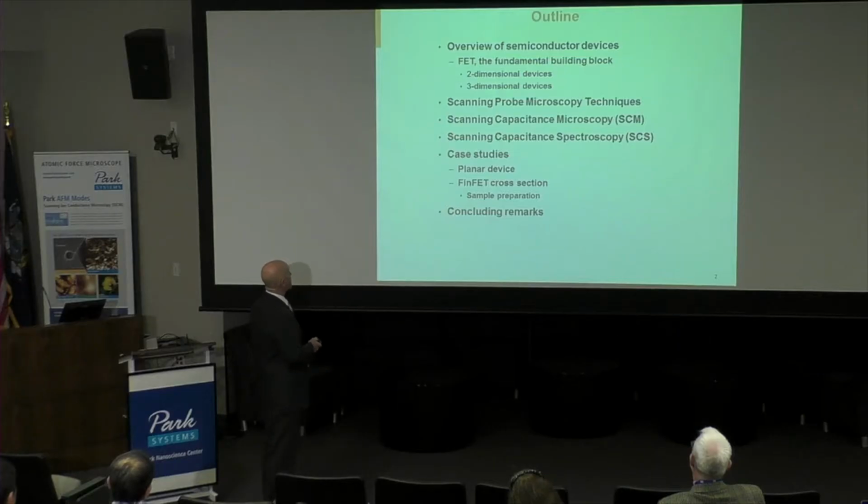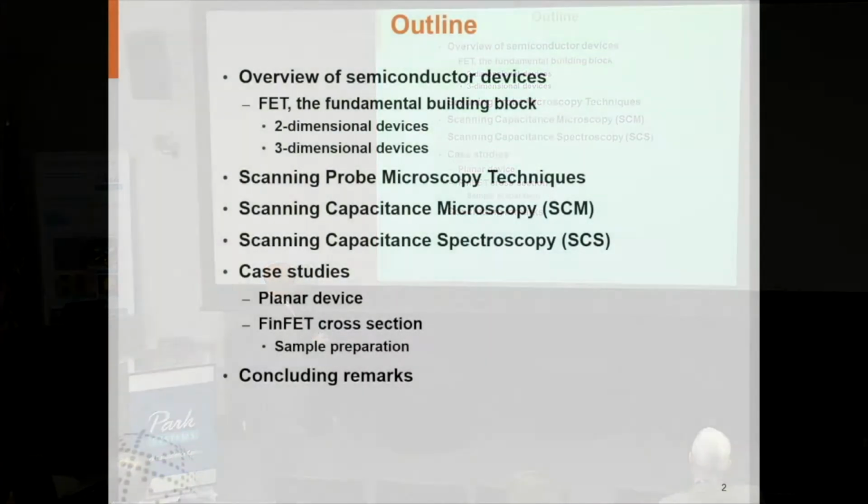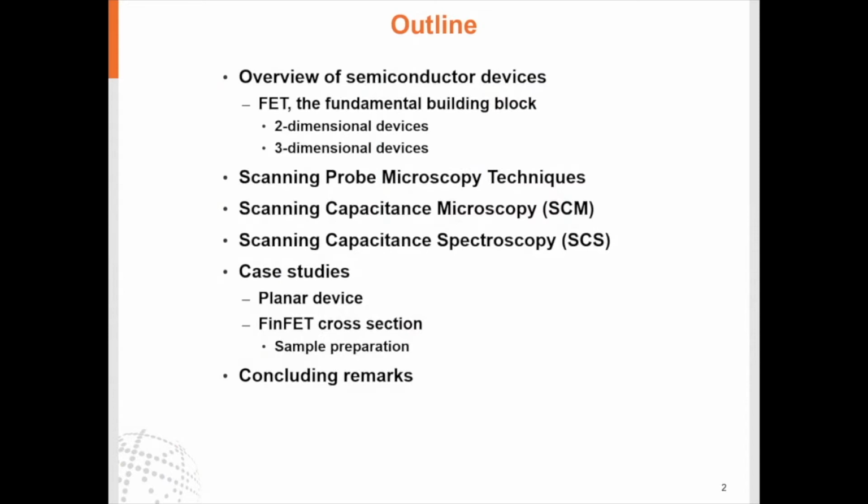So the two-dimensional devices kept getting smaller and smaller and smaller. Well, something had to change. So the transition to three-dimensional FinFETs: we're going to talk a little bit about FinFETs, the structure, the functionality. I'm going to talk a little bit about scanning probe microscopy techniques, the techniques that we've used over the years to analyze these devices, to be able to provide empirical data to device designers and technology developers.